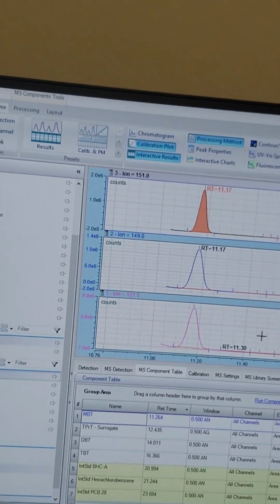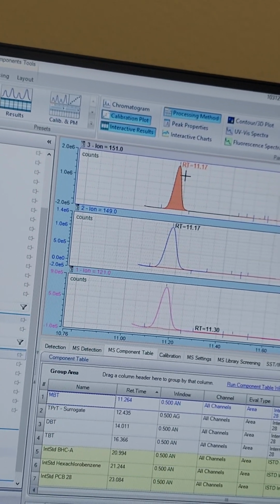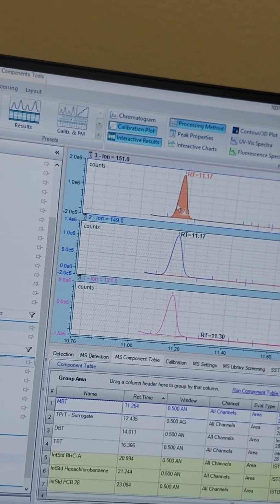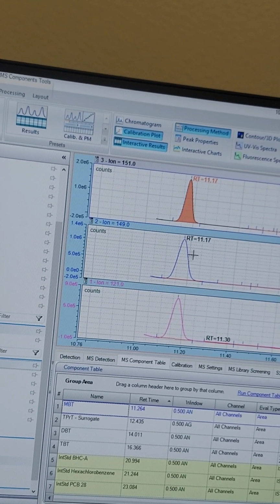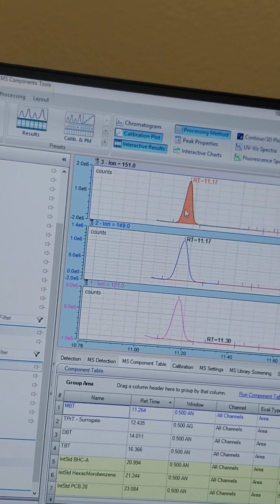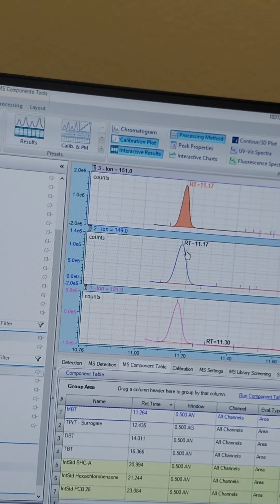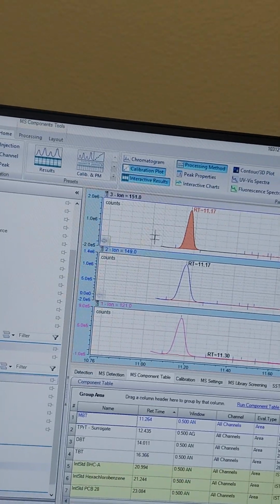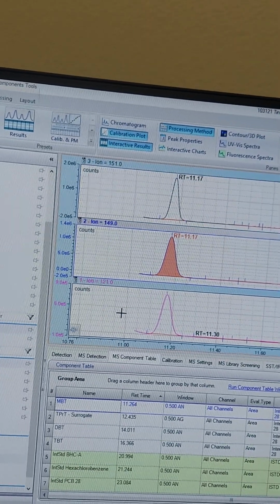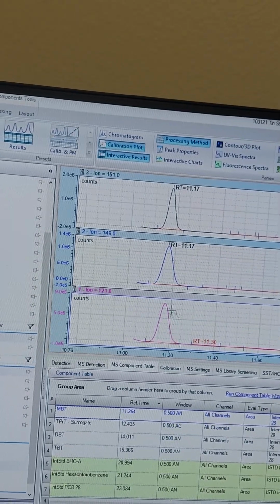The analyte gets split up in the mass spec, and it measures the intensity, and the other ions that were made also get measured. To confirm that this is what we're seeing, this ion and this ion have to look how we're expecting.